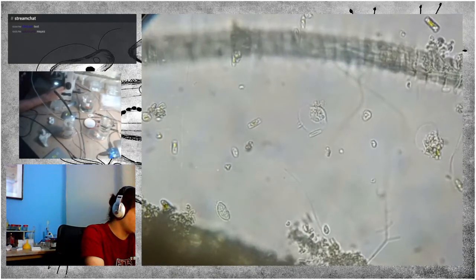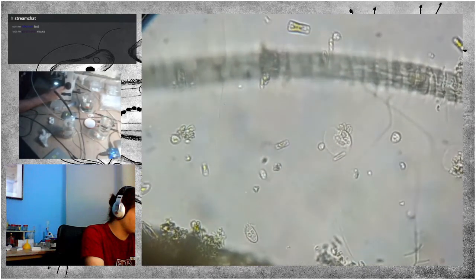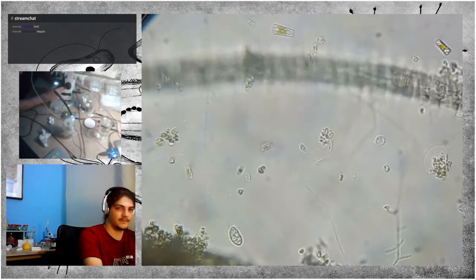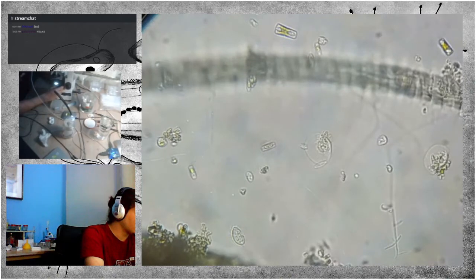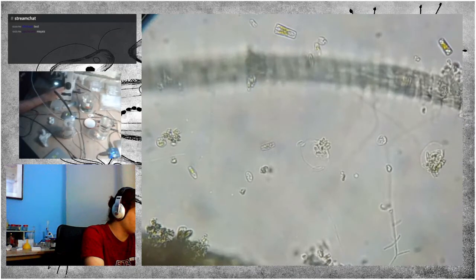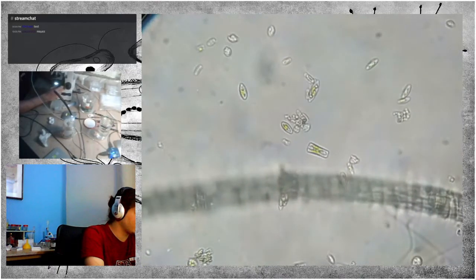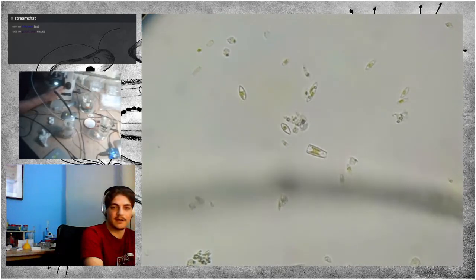And this one also, right in the center of the screen now. You can just about discern it, and you can just about tell that it's moving. Now let's open the diaphragm.